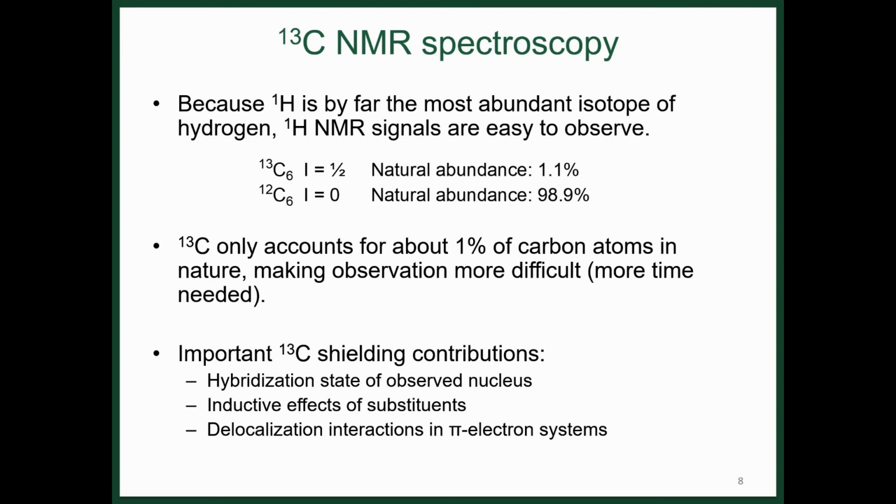Now, the important things for you to think about as you work through the tutorial that we're going to have in MNova, teaching you some of the properties involved with NMR spectroscopy and learning how to think about connecting structure with a spectrum, is that the hybridization state surrounding the C13 changes how the electrons are distributed. And because of that, there are a lot of patterns that we can bring in, thinking about where these signals show up and how they're related to a C13 atom's environment.